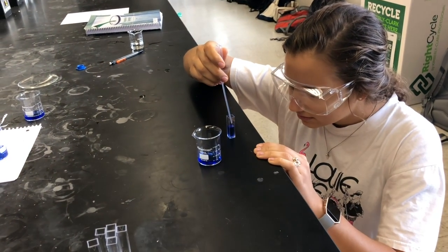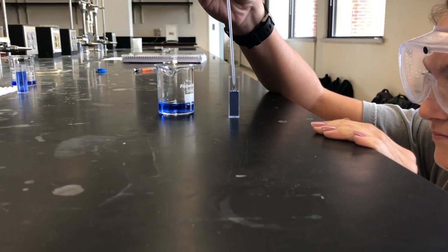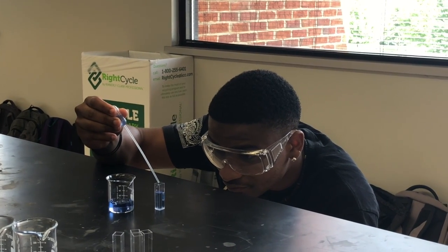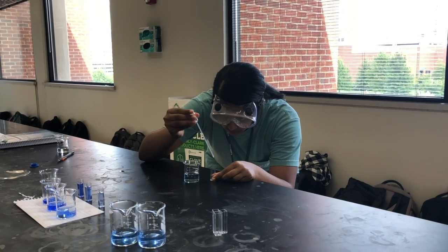First, each member of the group carefully transferred some solution from each of the standardized series of dilutions to a clean cuvette using a transfer pipette. We made sure that the solution did not pass the mark indicated on the cuvette.